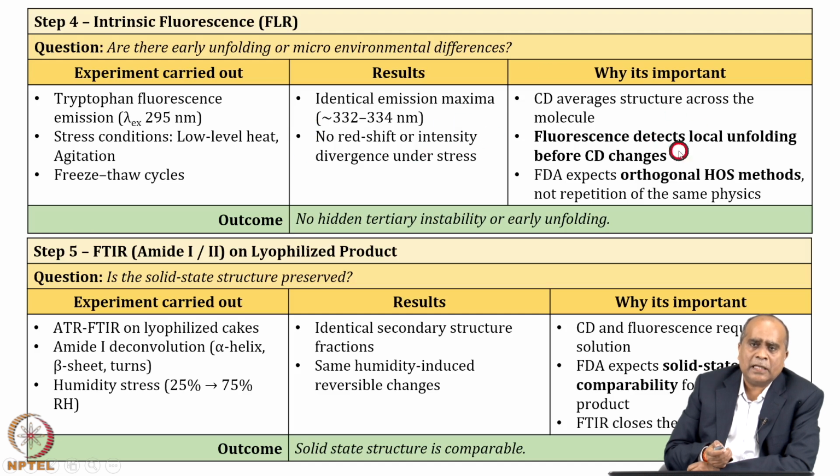So, CD averages the structure across the molecule, but fluorescence detects local unfolding that happens even before CD changes, and the FDA expects orthogonal HOS methods. So, there is no repetition of the same physics; you are using fluorescence for looking at the dynamics. So, whether any hidden tertiary instability or early unfolding is happening can be answered by fluorescence.